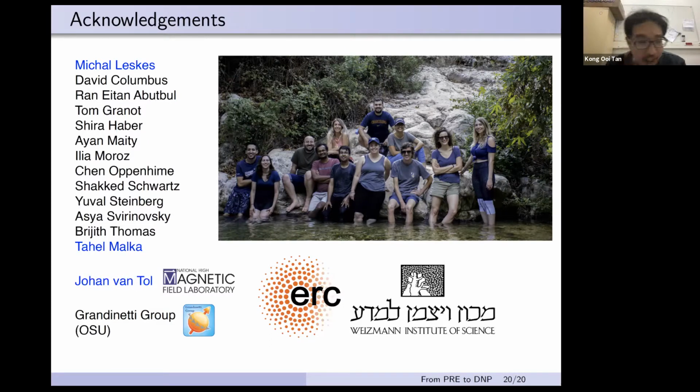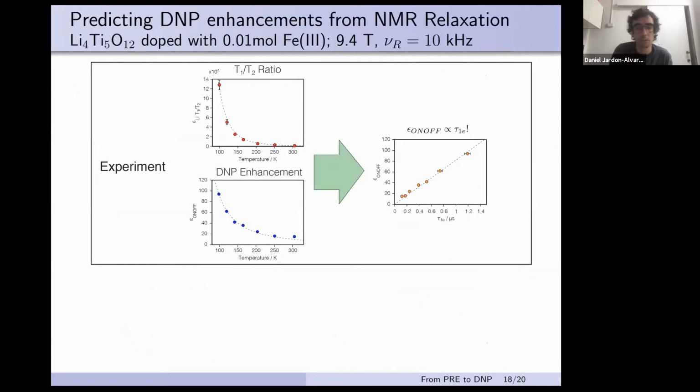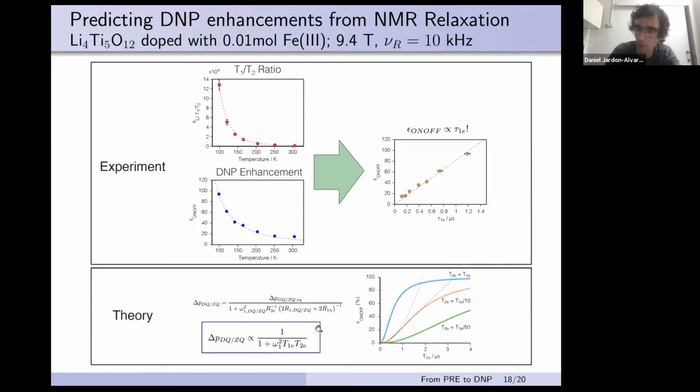Yeah, I'm just curious. I think in one of your field profiles you have the enhancement factor of 11, 3, or 1. But I'm just curious, can you tell us a little bit more about the DNP build-up time for these experiments? Yeah, in all these experiments, basically the DNP build-up time is about T1. So T build-up is more or less the same as T1. And the reason for this is just that T1 is the limiting factor in the enhancement over here.